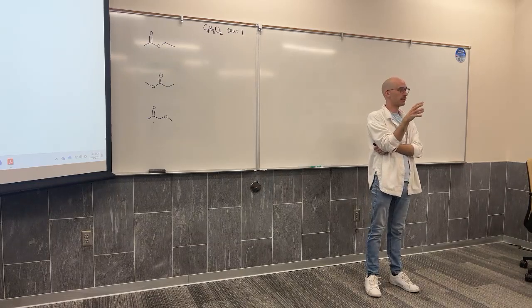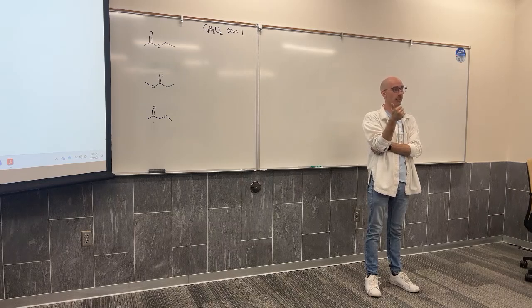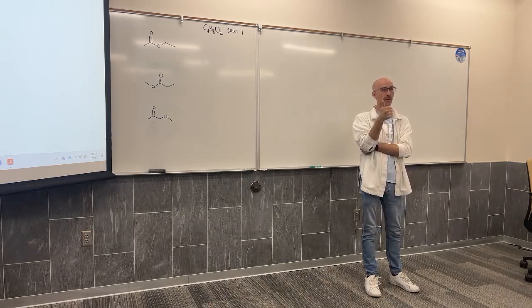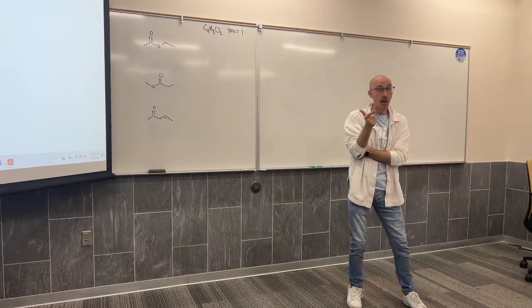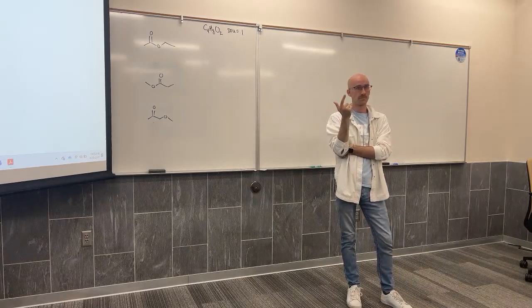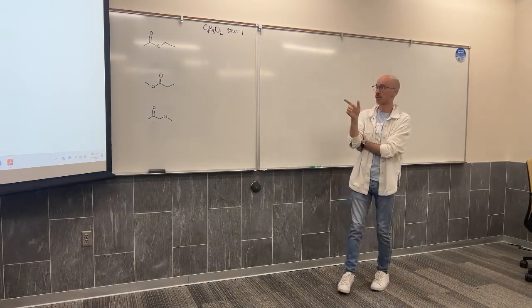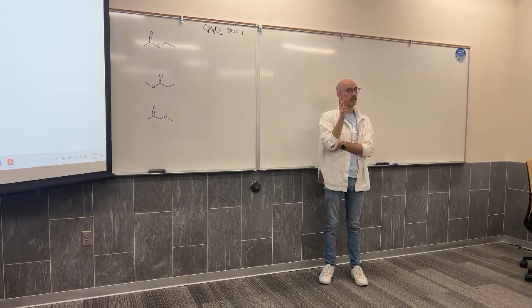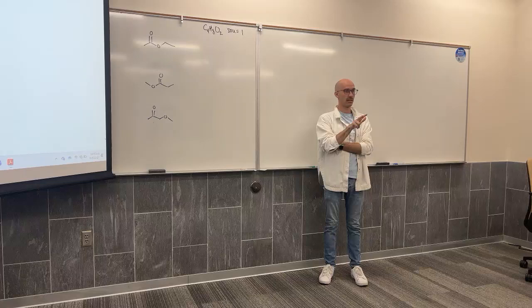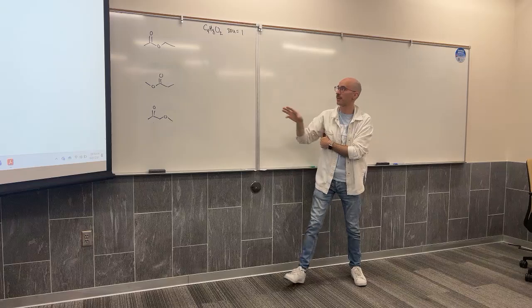So then we looked at the IR, and the IR spectrum told us there is a CO double bond, which means the degree of unsaturation is not due to a carbon-carbon double bond. There are no CC double bonds. There were no sp2 CH bonds. We saw evidence of the CO double bond. We saw no evidence of the OH stretch for a carboxylic acid or an alcohol, which tells me that we're dealing with either an ester, a ketone, or an aldehyde. We also looked at the IR and said that there is no CH of the aldehyde.